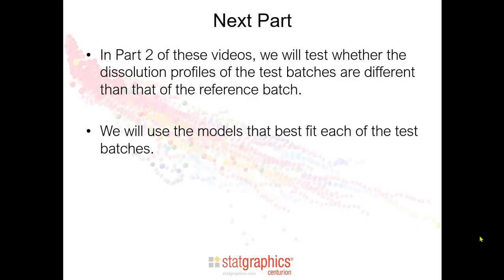In part 2 of these videos, we will test whether the dissolution profiles of the test batches are different than that of the reference batch. We will use the models that best fit each of the test batches.